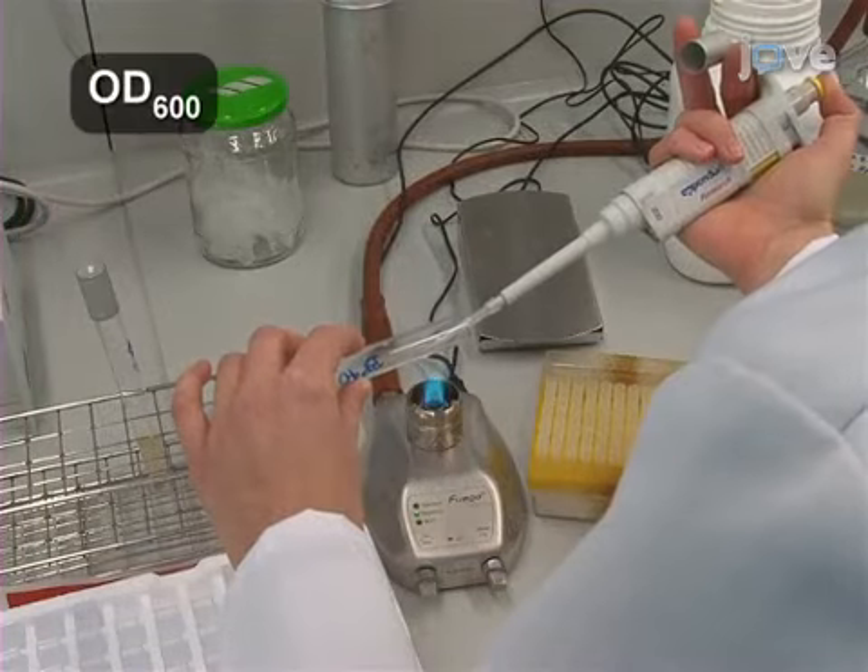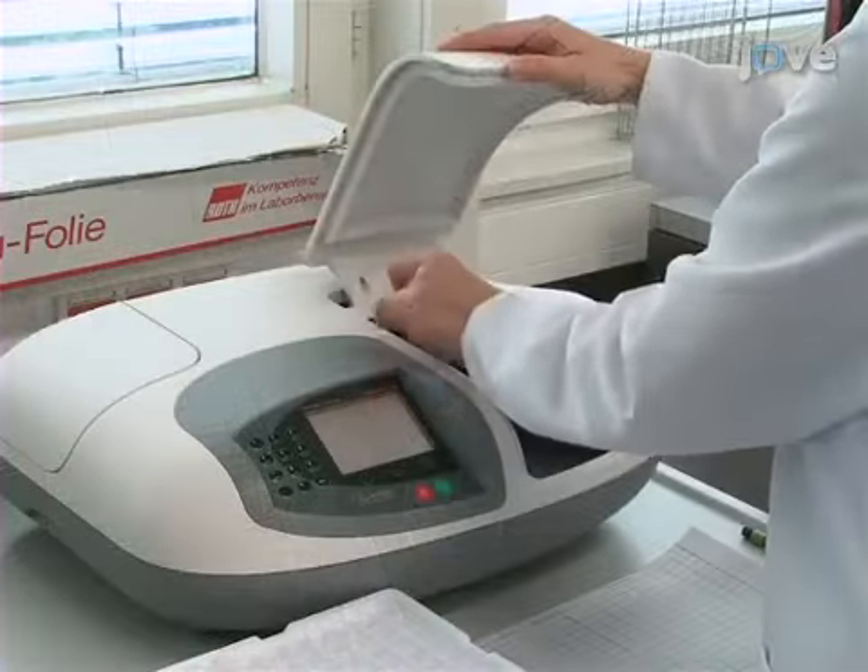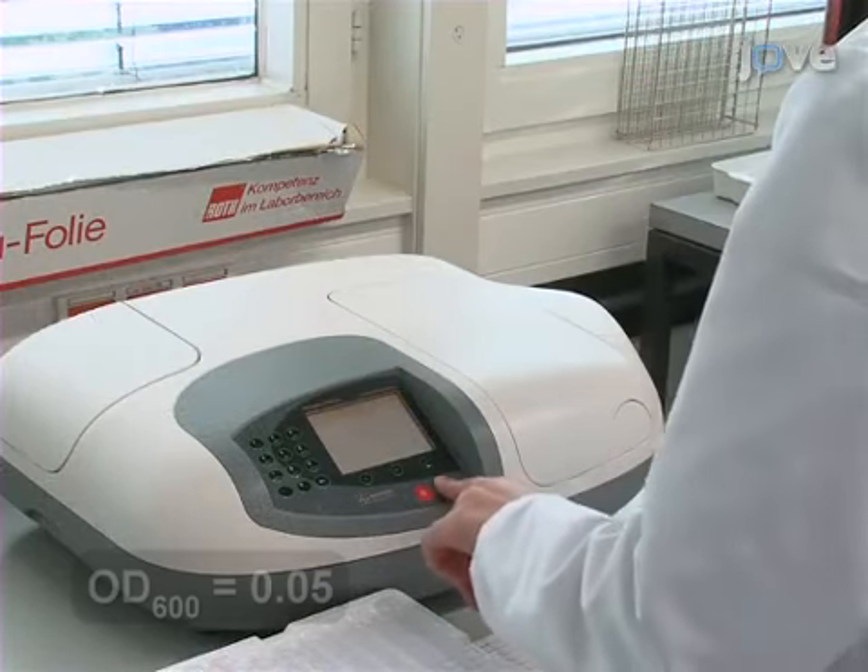Dilute 0.1 milliliters of culture into 0.9 milliliters of LB medium in a 1.5 milliliter cuvette and determine the optical density.